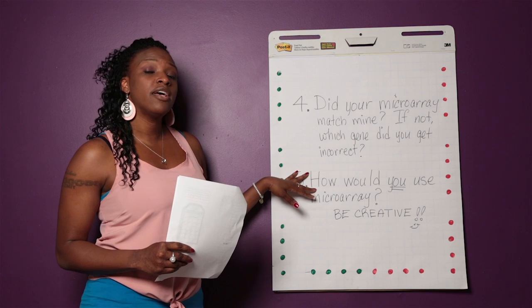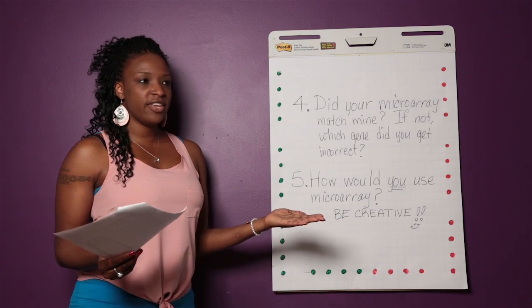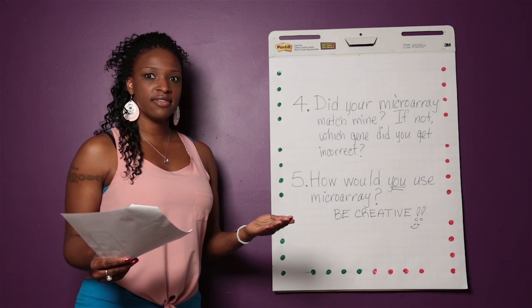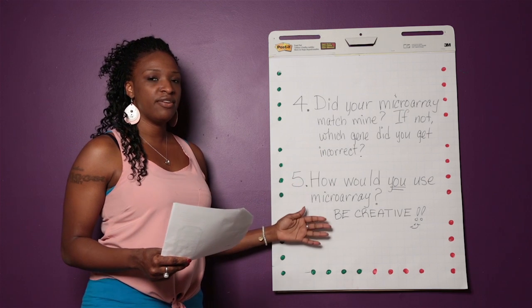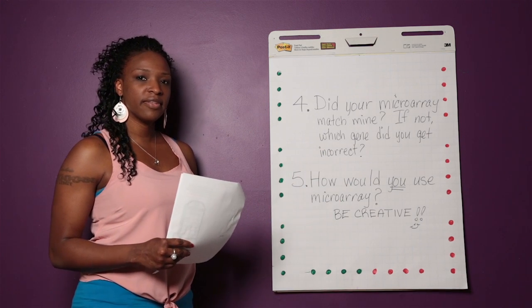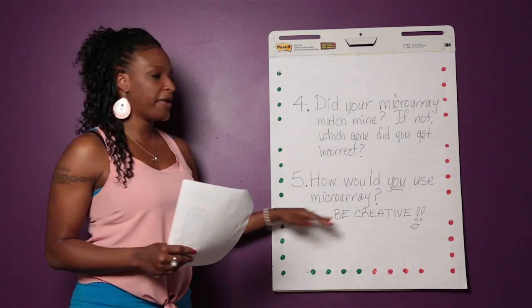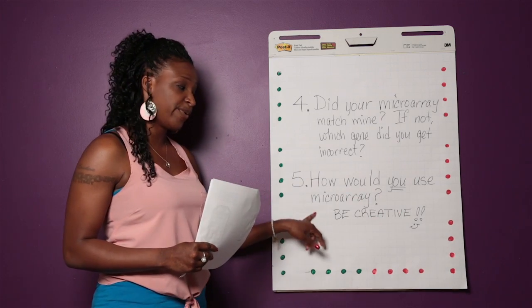Some genes could be upregulated under both conditions. Some genes could be no change at all. So that's one thing that you may see. In a microarray chip, you would see green, red, and sometimes you see black on a real microarray chip. But this is just to give you the concept of microarray. And number 5, how would you use microarray?